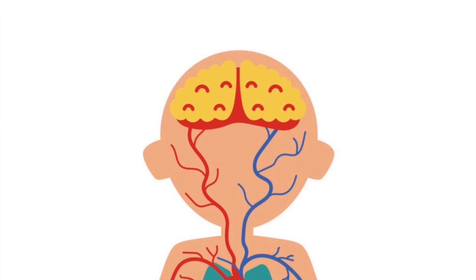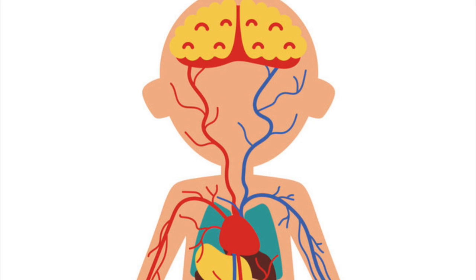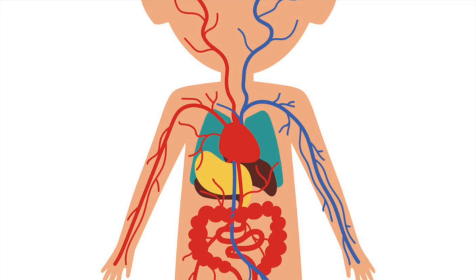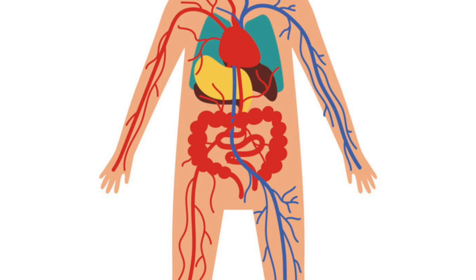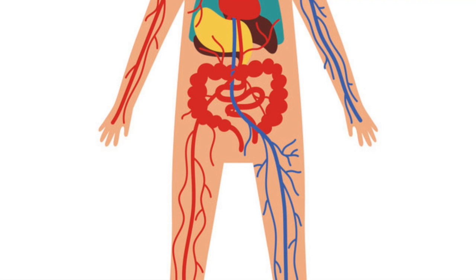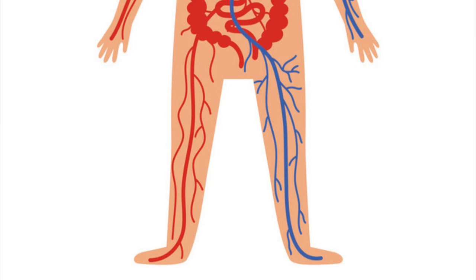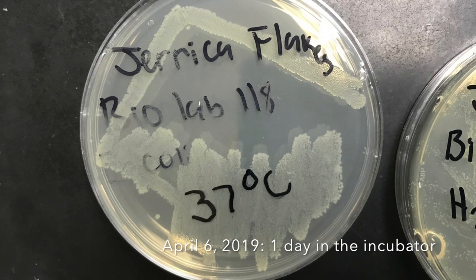Since the body is at 37 degrees Celsius, it gives me a slight idea on how fast bacteria or germs spread and make us sick. This experiment also gave me insight to how fast the immune system fights back. For today, I will show you my 37 degrees Celsius E. coli and swab.